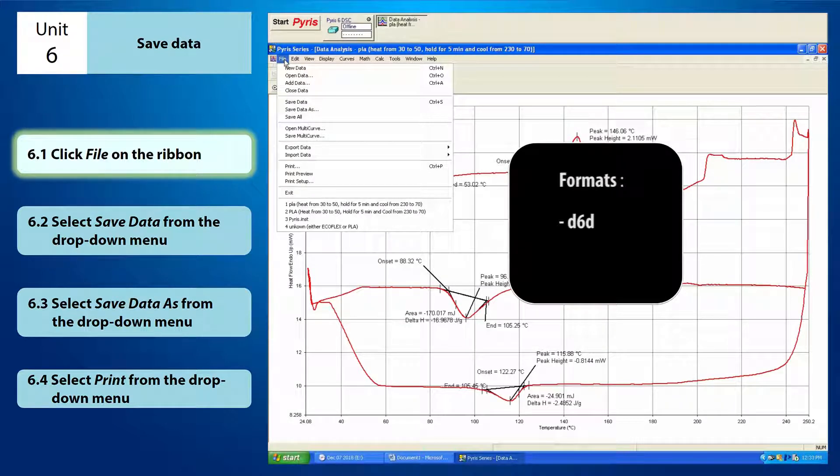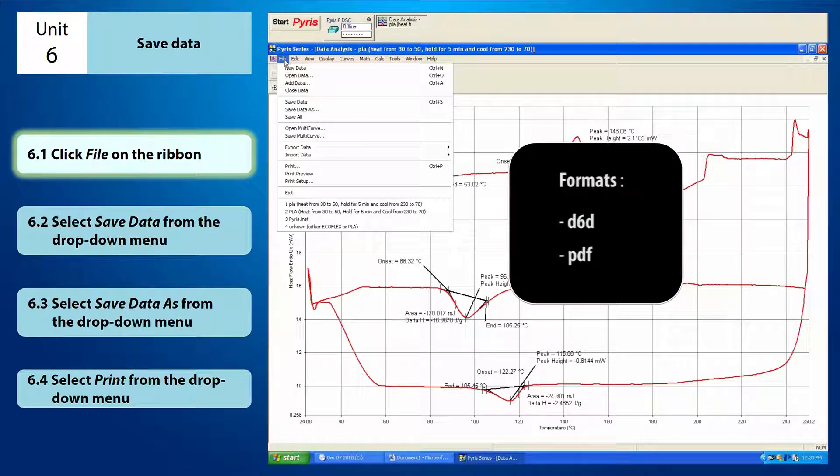The second option is PDF format. This option allows you to save the data in the form which is presented and organized neatly on a page with all the details like the sample ID, sample weight and method steps used.